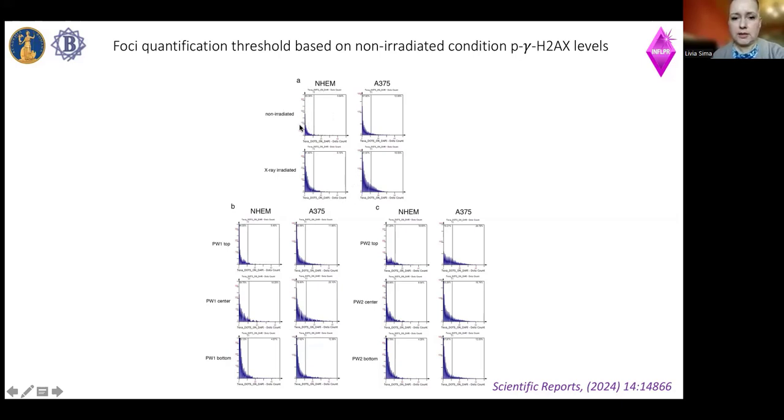So in our example, we have compared samples obtained from the two experimental flasks exposed to the 1 petawatt laser generated electrons in comparison with the cells that were irradiated by a conventional X-ray source.